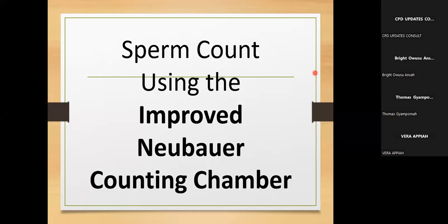Okay, so just a small amount is what you are going to immobilize. And I've shown you how to immobilize even if you don't have a water bath. You heat water and mix two parts: take 20 ml of the hot water and 10 ml of tap water, and you get 30 ml. This is likely to give you a temperature of around 60 degrees.